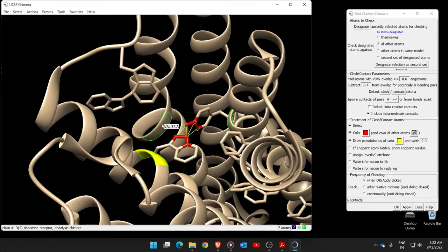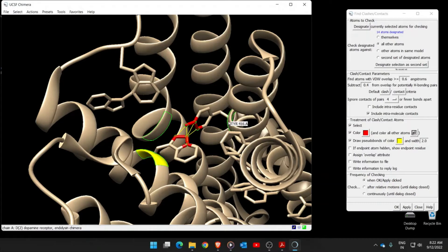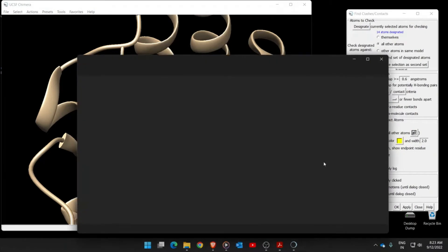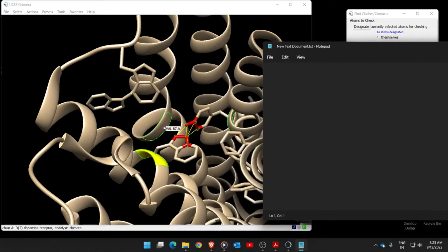Next, identify the amino acids where clashes are occurring - which residues show hindrance to the newly introduced amino acid. Note them down: it is Valine 87 and Tyrosine 416. Make a notepad and type those amino acid numbers. The amino acid we replaced is residue 114, which is tryptophan.